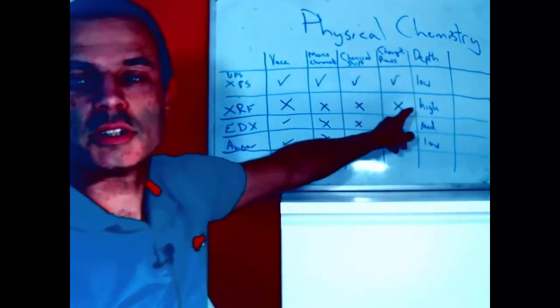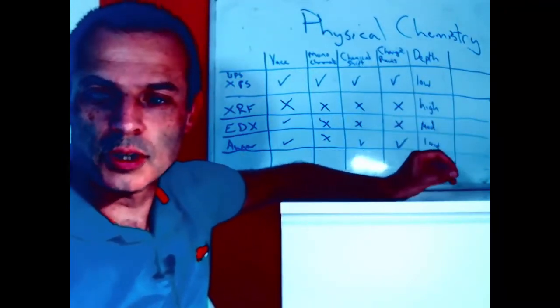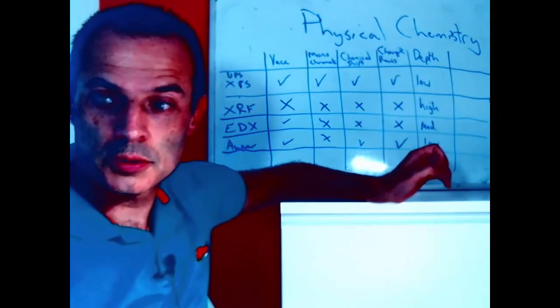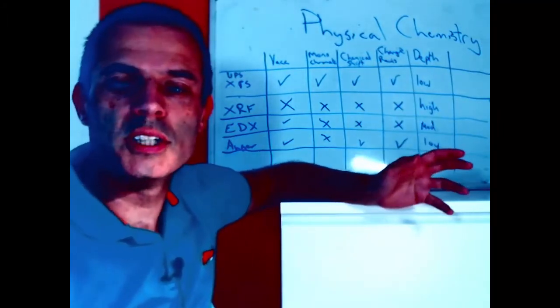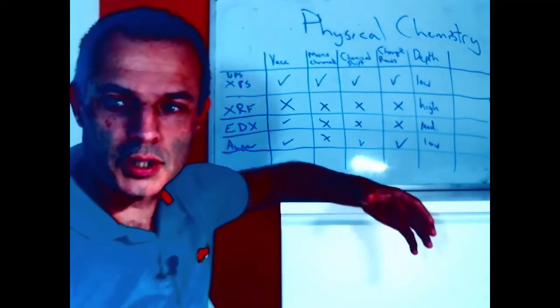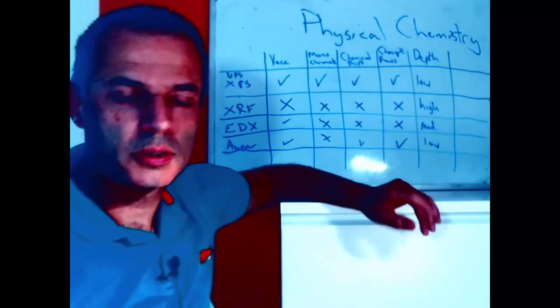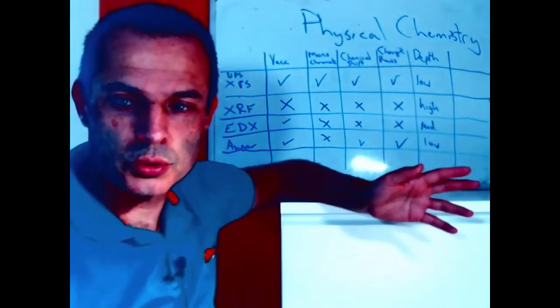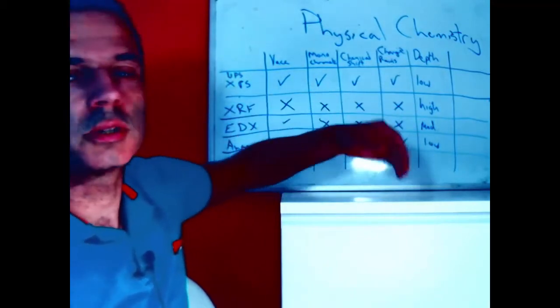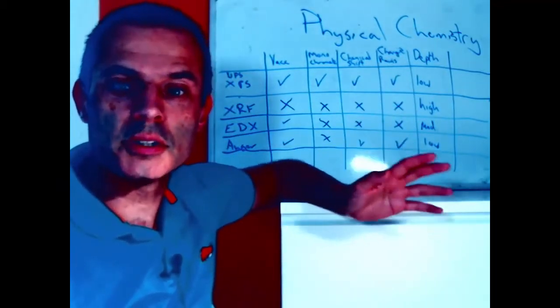X-ray fluorescence has a high penetration depth, which is still only a few micrometers. So if we take a material, we typically get through the layer of dirt on the outside and can see the bulk material, but different energy X-rays can penetrate out because it's the low energy one coming out. So different energy X-rays can escape from different depths, and there is a critical problem.